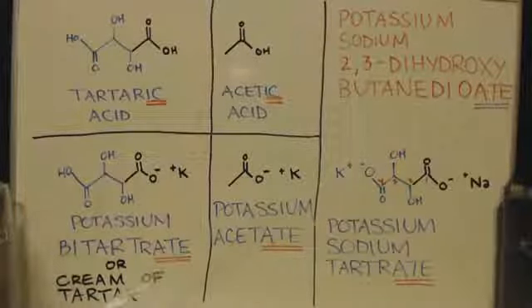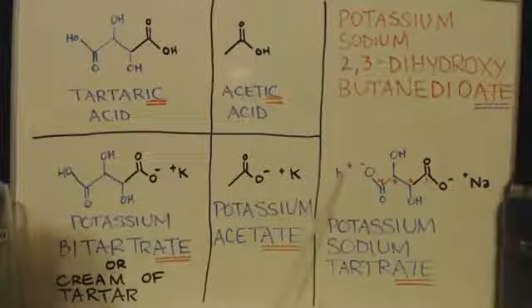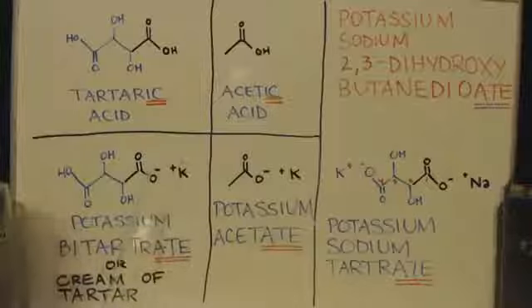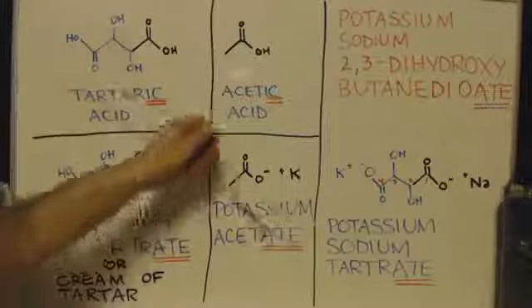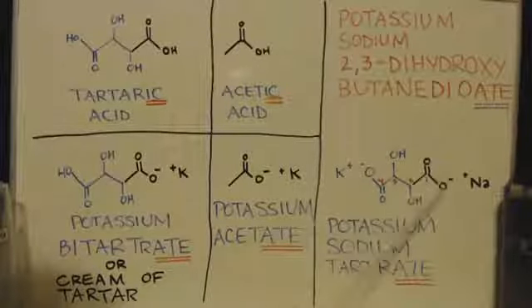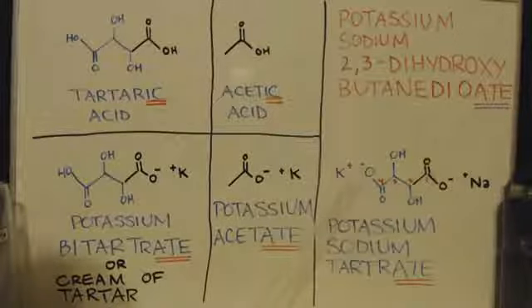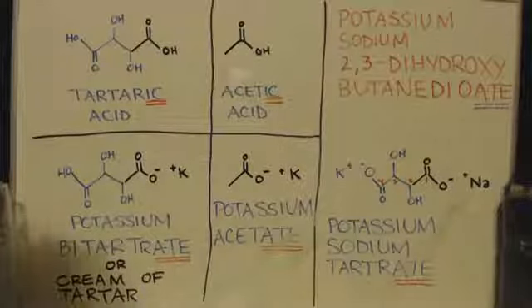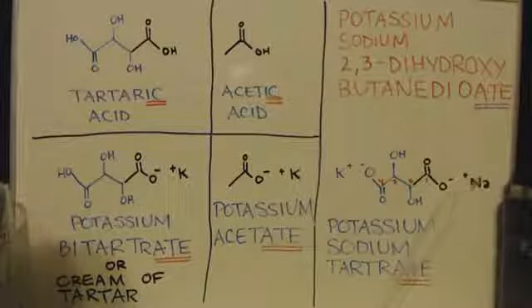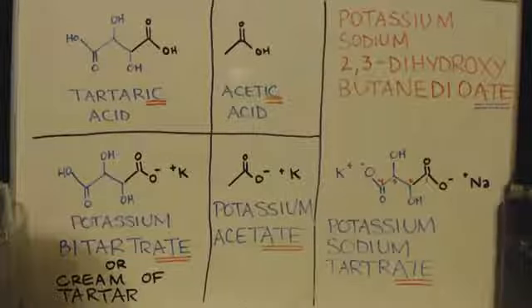Now I want you to look over here because there are two. If I flip this around, that's what I did over here. See how the potassium is on this side? I basically picked this up and went like that, so that this side is now on this side. See how you have another? It's just the same exact thing as acetic acid. So basically this side's already done when we buy it as cream of tartar, right? So all we have to do is get the other side to make that salt. And that's the part we're doing.